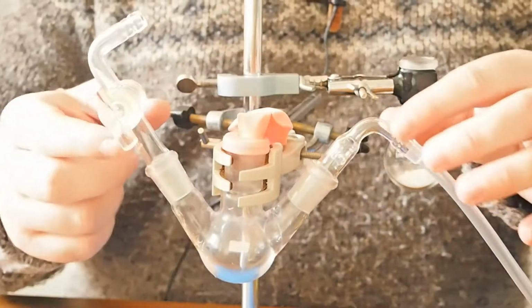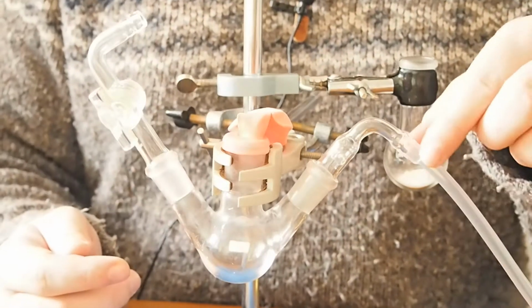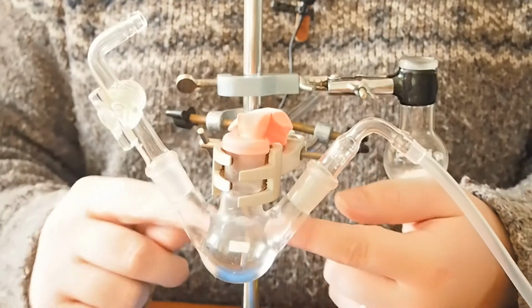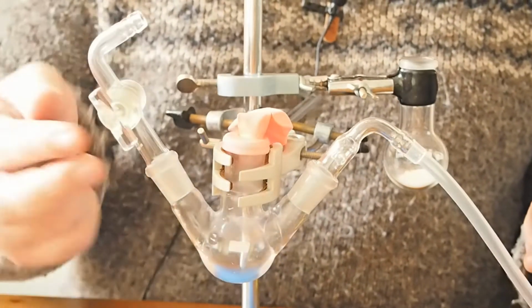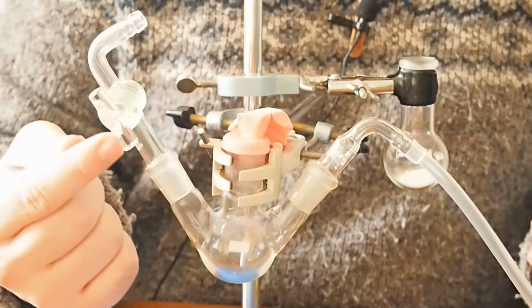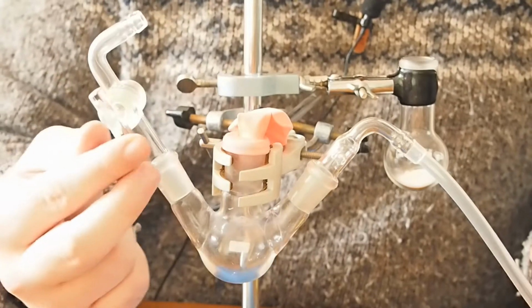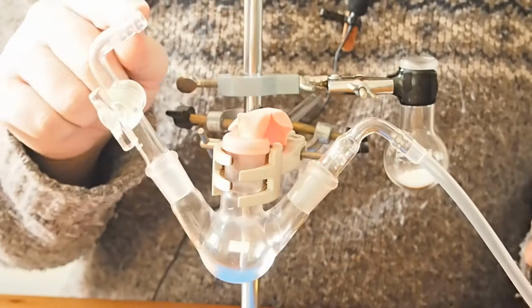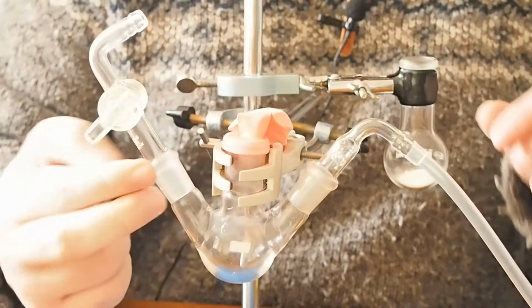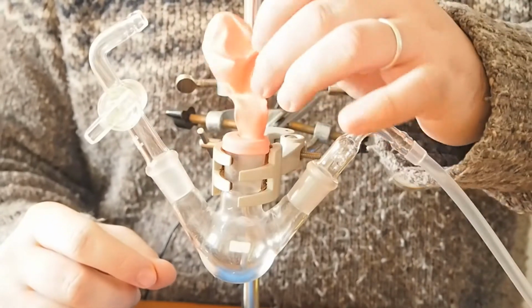Now, firstly, we're just going to look at this front bit here. What I've got is we're going to have carbon dioxide come in this direction, and it's going to come in and it's going to flush the air out. I'm going to keep this tap open. You can tell the tap's open because this is parallel with the tube. And once I've flushed this system, so I can hear it hissing out of here a little bit, I'll close this tap, and this balloon should start to fill with carbon dioxide.